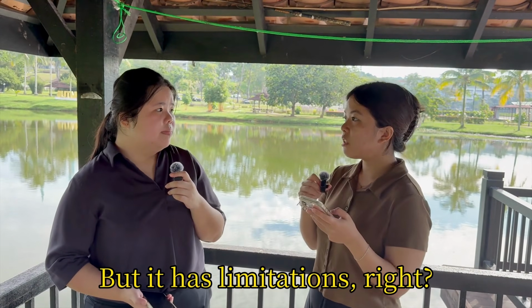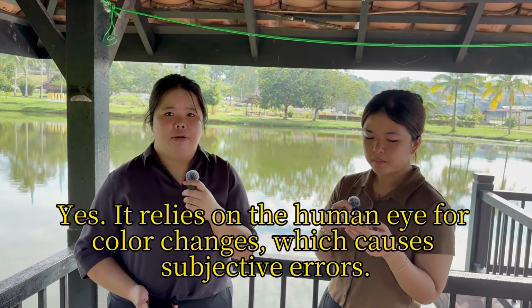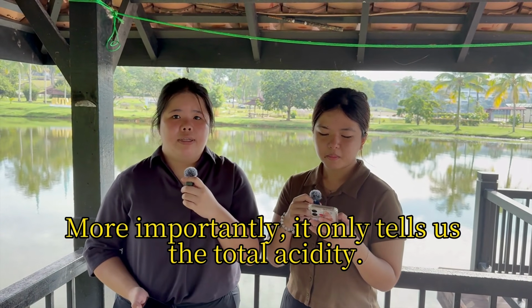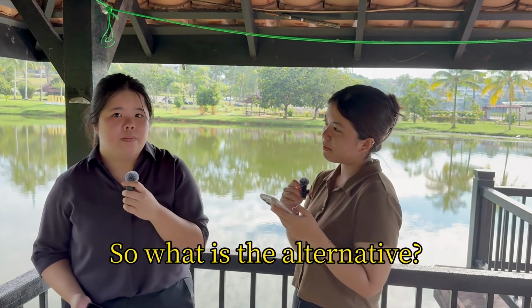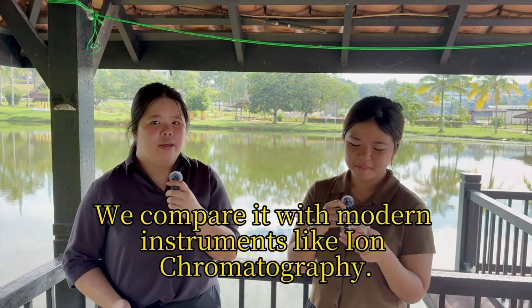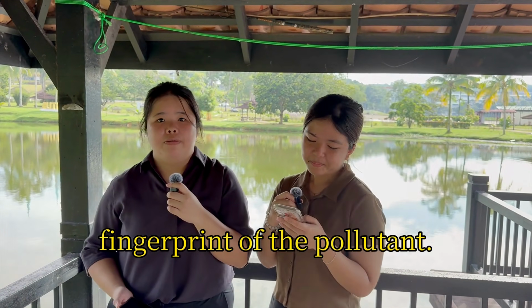But it has limitations, right? Yes, it relies on the human eye for color changes, which can cause subjective error. More importantly, it only tells us the total acidity. It doesn't tell us which specific acid was dumped. So what is the alternative? We compare it with modern instruments like ion chromatography. Ion chromatography separates and identifies the specific chemical fingerprint of the pollutants.